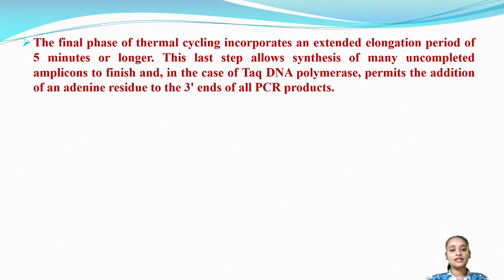So any single stranded DNA remaining from the elongation step gets extended in this final phase.